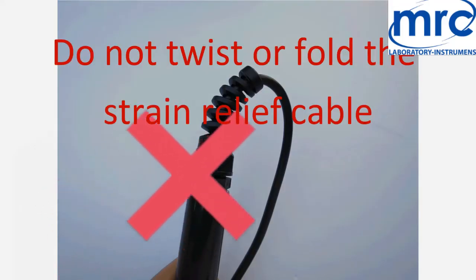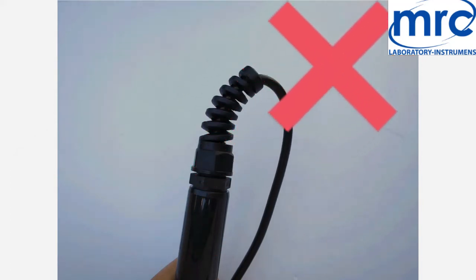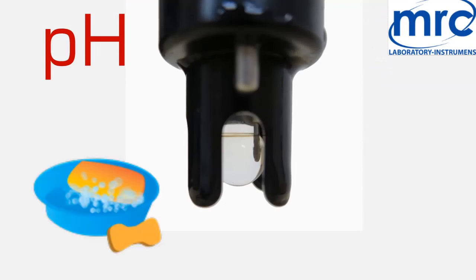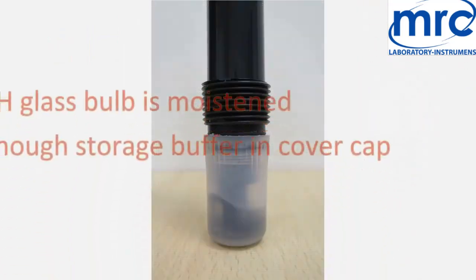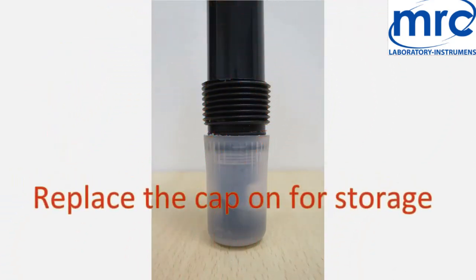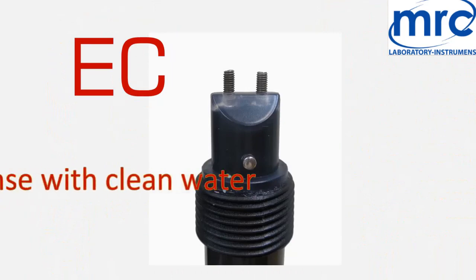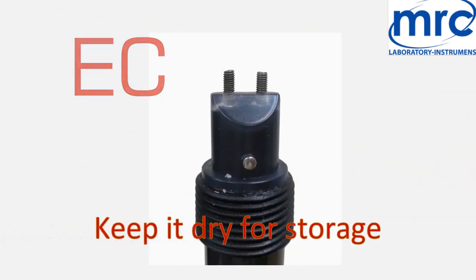Do not twist or fold the strain relief cable. If the pH probe is stained with grease or dirt, clean it with neutral detergents. Make sure the pH glass bulb is moistened at all times and that there is enough storage buffer in the cover cap. Replace the electrode cap for storage. For the conductivity probe, rinse with clean water, then wipe and keep it dry for storage.